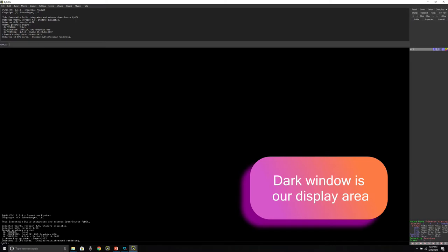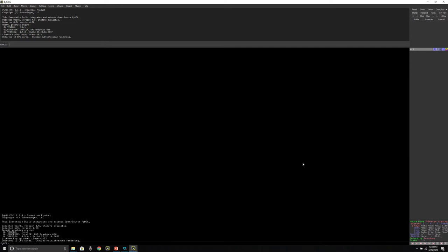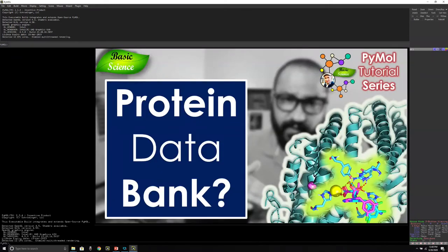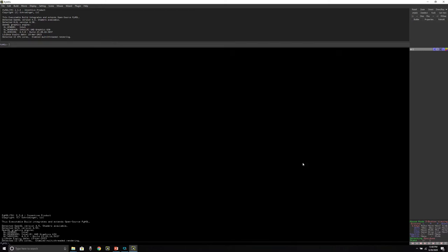This central area is known as the display area. If you're following this series, I've already made a video on how to use the Protein Data Bank — what features and options are available and how to download structure files from it.